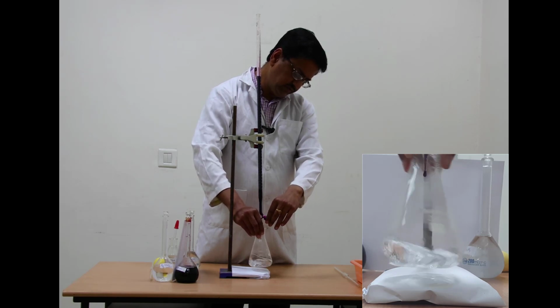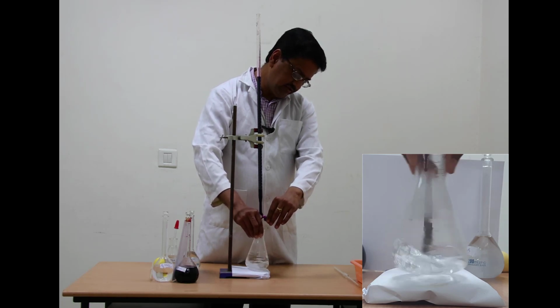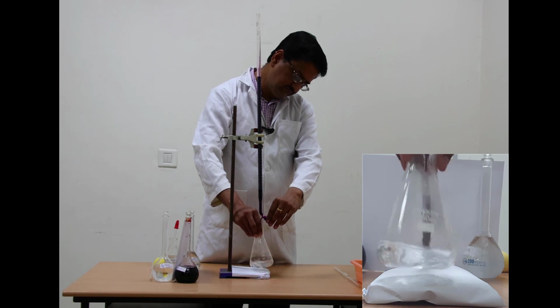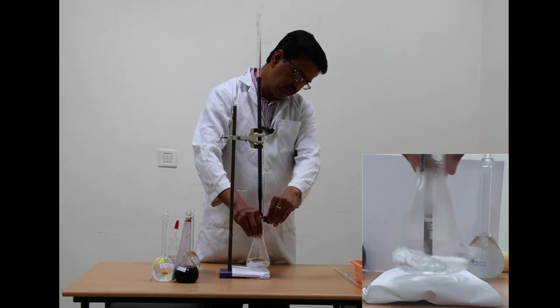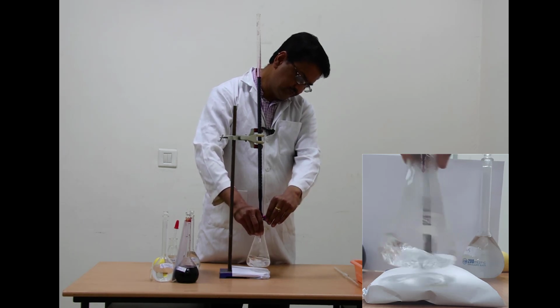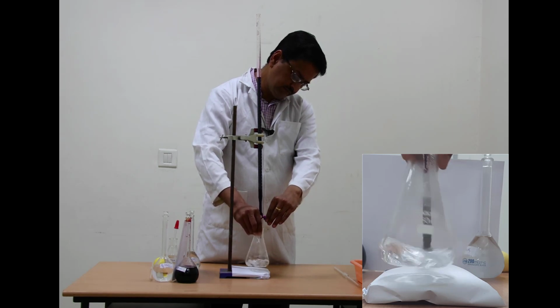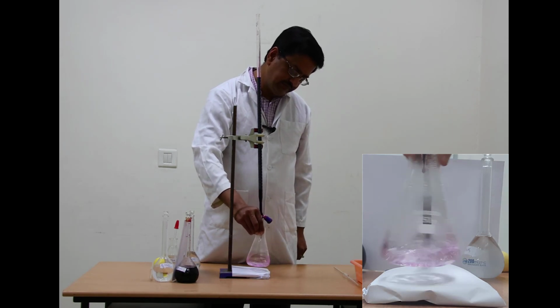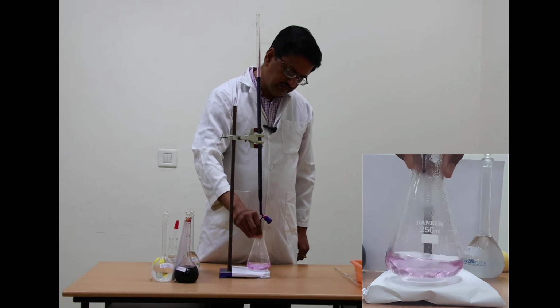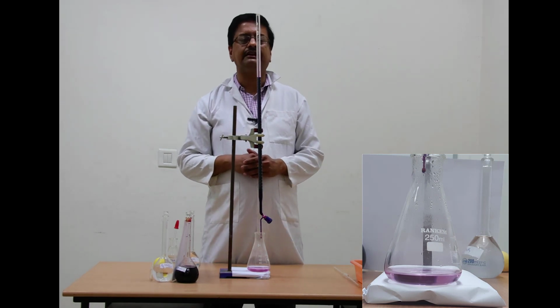Now you can see that we have come very close to the equivalence point, and that is why the decoloration of permanganate is taking a few seconds longer than before. At this point, one has to be very, very careful to add only one drop at a time. See, this is the faint color of the end point, which persists for about 30 seconds. So this color should be reached with one drop and not any extra drop.